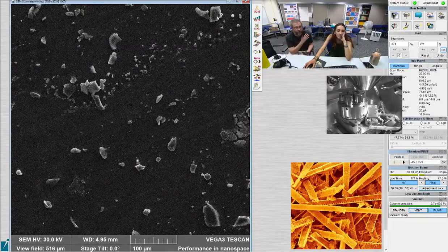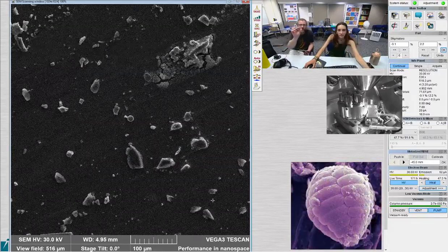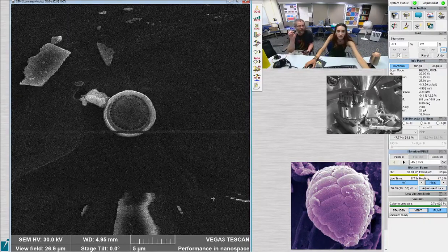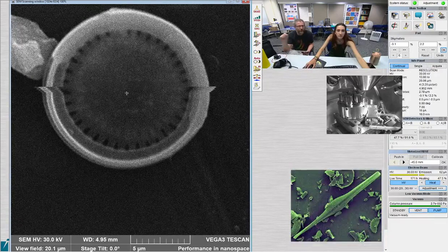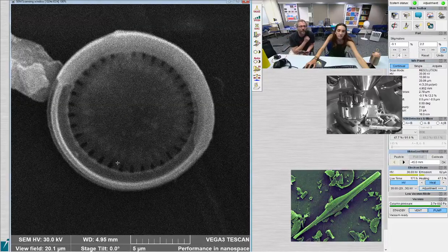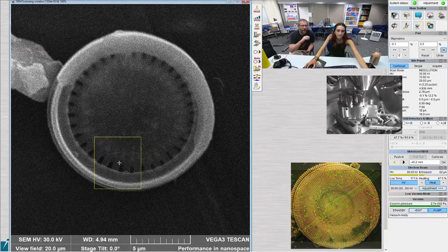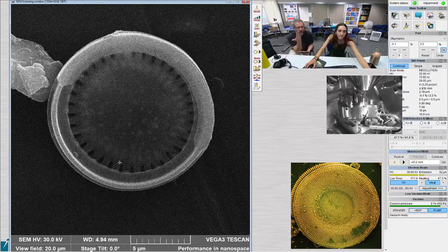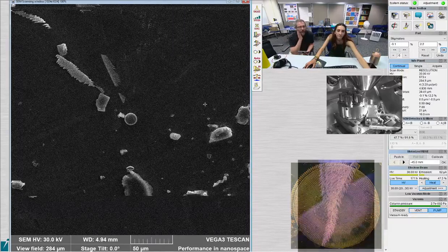It's almost exactly like an XRF. The problem is that for a lot of elements, the difference between one shell and the next might be small, so if you have that jump between two different elements, you might get a similar characteristic X-ray coming out. So it's sometimes difficult to tell what you're looking at specifically. There's a range of things it could be, and it uses some sort of algorithm to detect which one is most likely based on its exact energy.